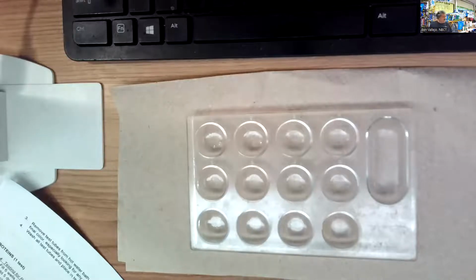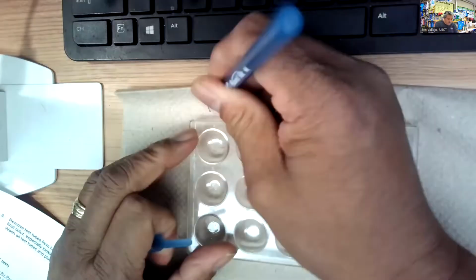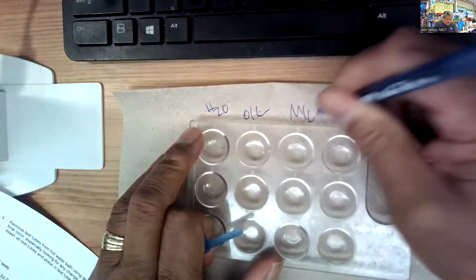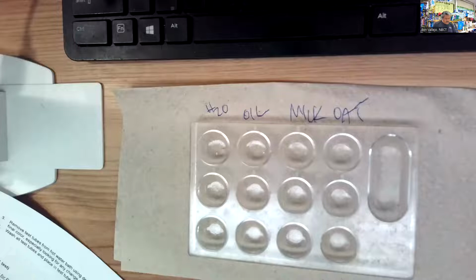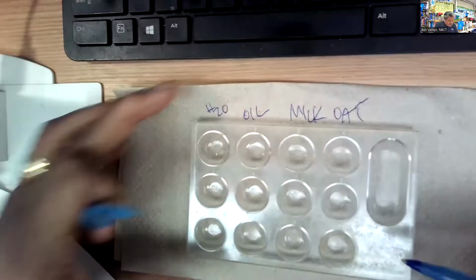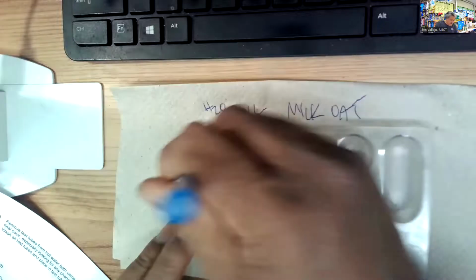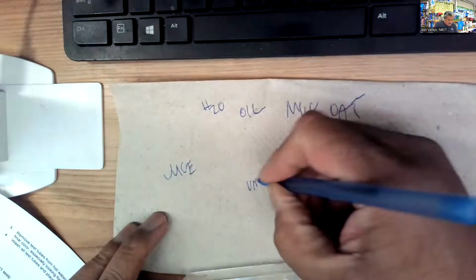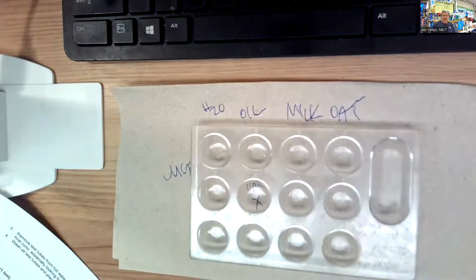Let's see, I have a pen handy to mark these. This will be water, oil, milk, oatmeal, and then I'm going to have juice and unknown X. Juice over here, and then the unknown X is going to be right there.